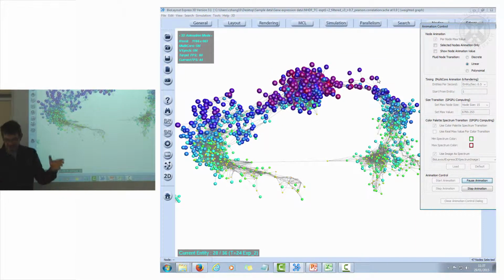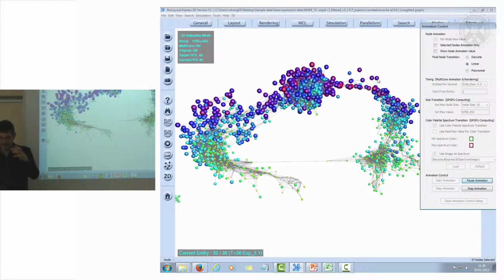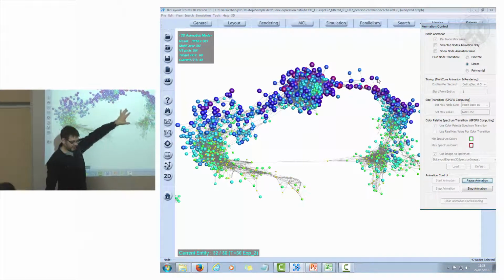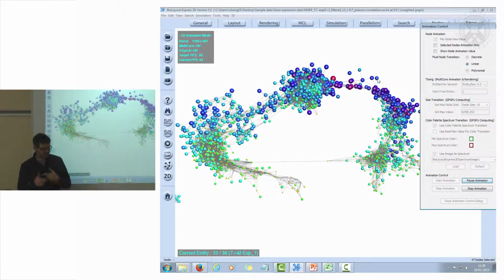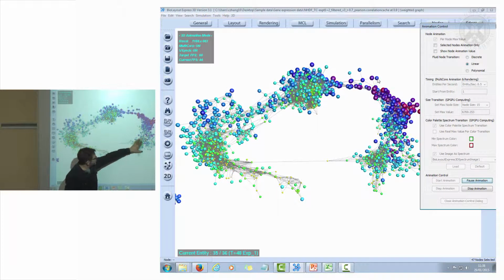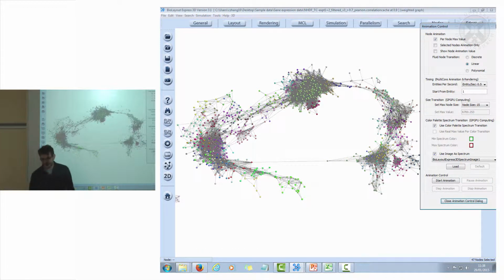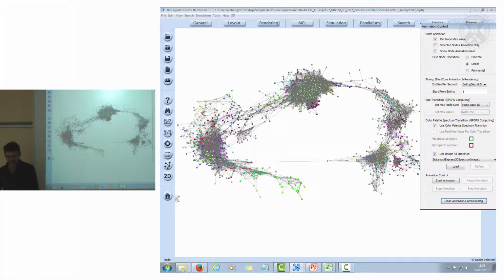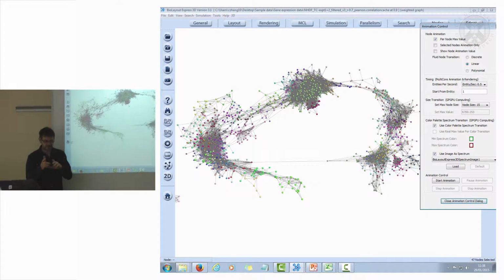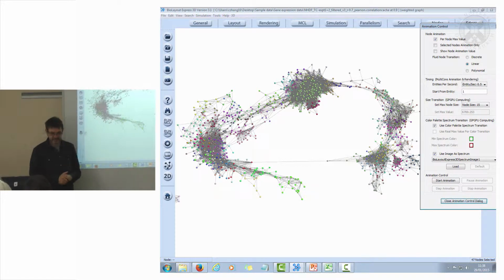It'll get to a point and actually nothing much more is changing because the cells have become asynchronous, and essentially what you're seeing is the combined mix of cells proliferating with those just turning over. Okay. So it's interesting, actually probably these are more the G0 specific genes, because these guys are probably now saying. So it's quite a nice way of looking at the dynamics of data. Sometimes you can actually see stuff that way that you can't see by looking at it other ways. Works really well for time course data.